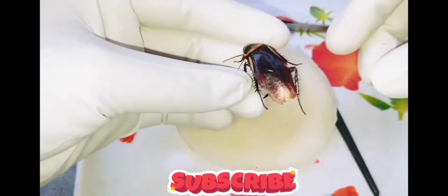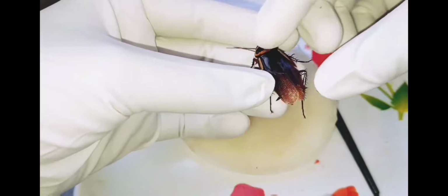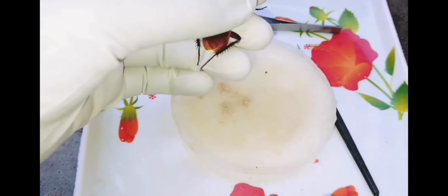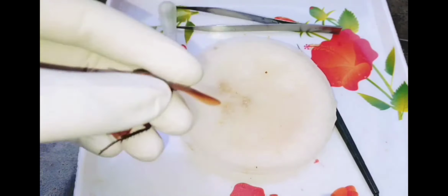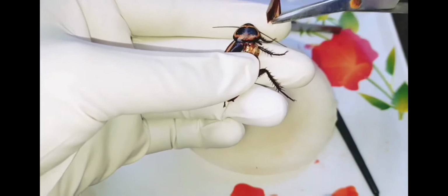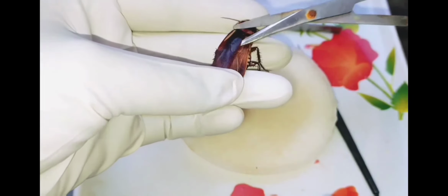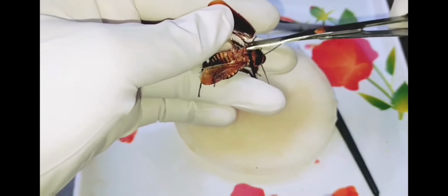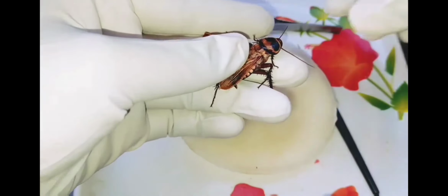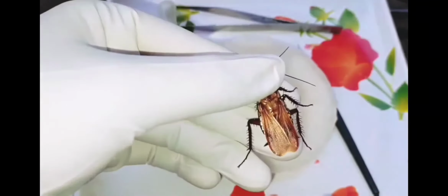Now start the dissection part. Let us dissect this cockroach. First of all, you have to cut all these tegmina. Then the hind wing, which helps in flight.